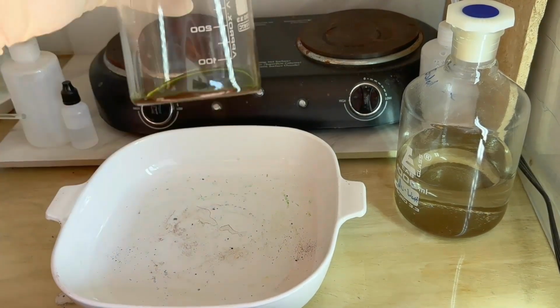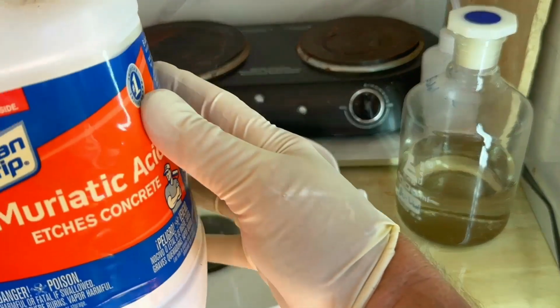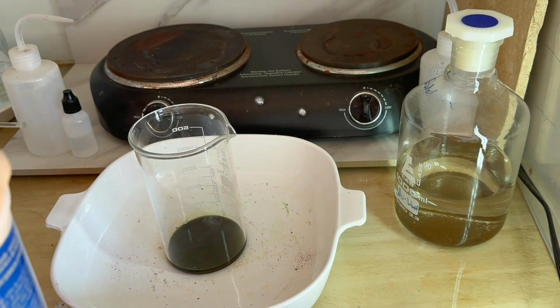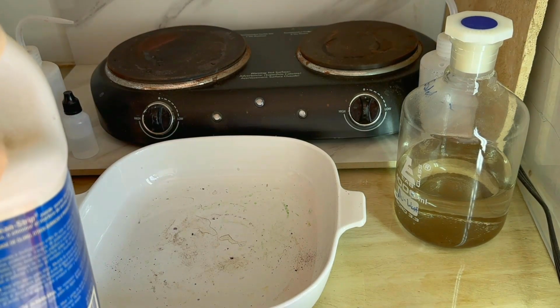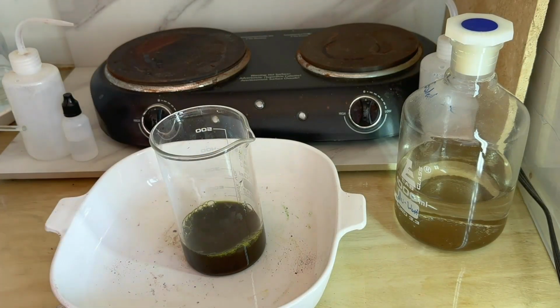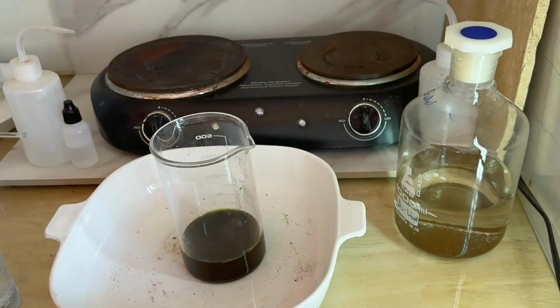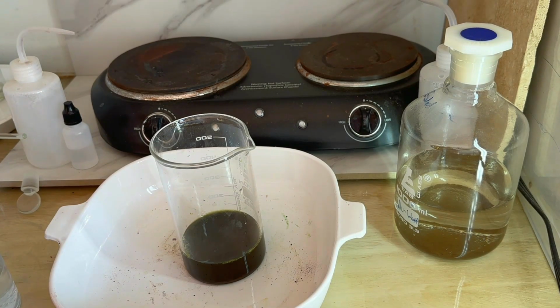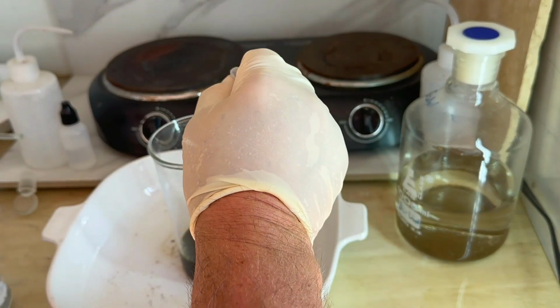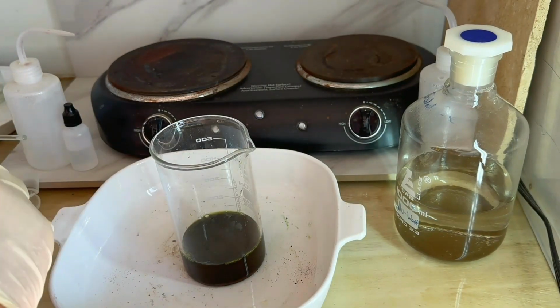These two on the left. For these, the first thing we're going to do is dissolve the precipitants in Aqua Regia, and then we'll refine and clean it from there. So we're going to add a little bit of muriatic acid, hydrochloric acid. Then we're going to add a few drops of nitric acid. I don't think there's a lot in here, so I'm probably just going to put maybe 4 milliliters. There are some base metals in there, so it might take a little more than usual to dissolve this.